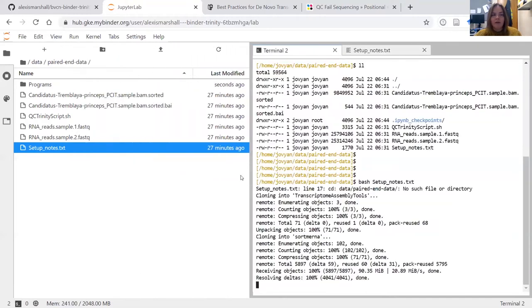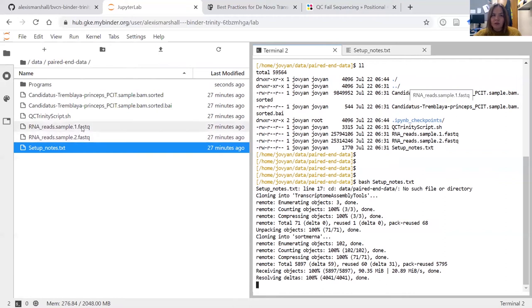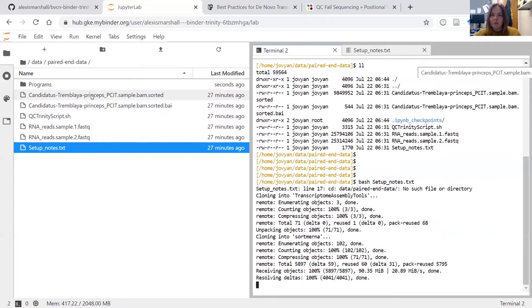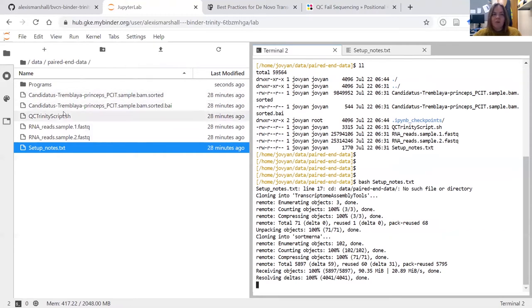As you can see, we have two RNA read files: read one and read two. These are Illumina sequencing files, so you get two read outputs. There's also another script I'm going to take you through in a second, and then two other files which are sample output files. In a future lesson we'll go through how to use those, but today we're just focusing on the four bottom files here.